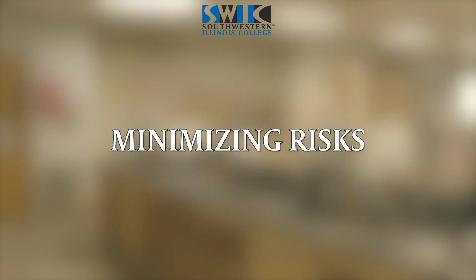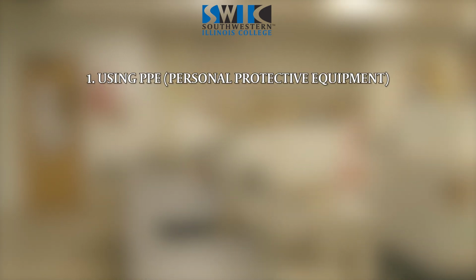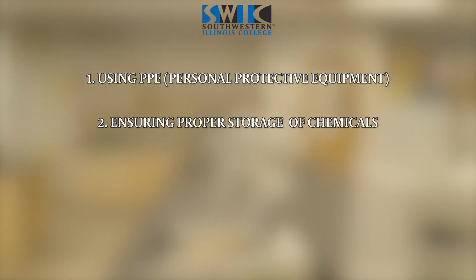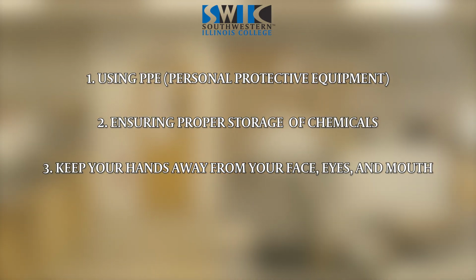By recognizing and respecting chemical hazards, you can minimize danger. This includes using suggested personal protective equipment, ensuring proper storage of chemicals, and following safe handling practices, such as keeping your hands away from your face, eyes, and mouth.